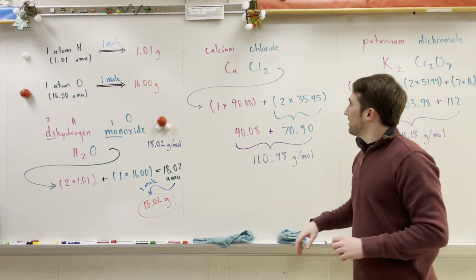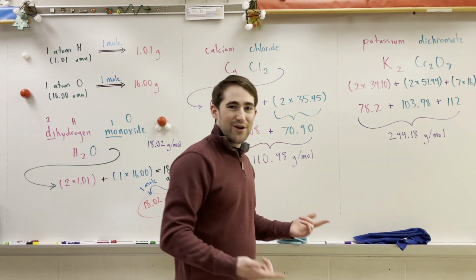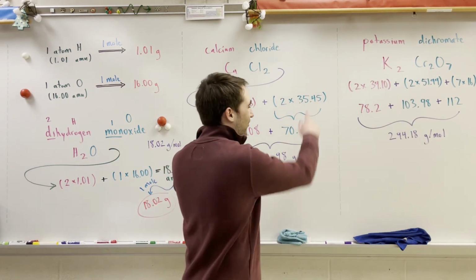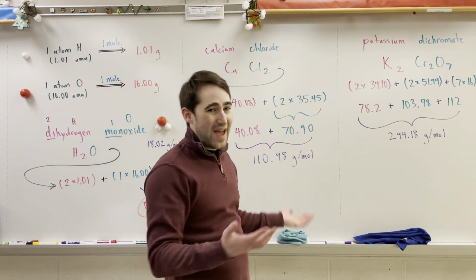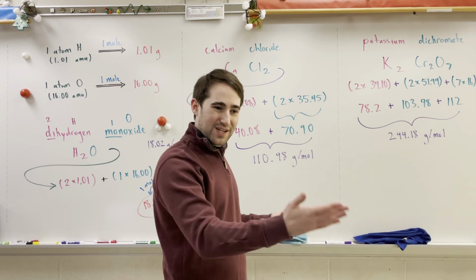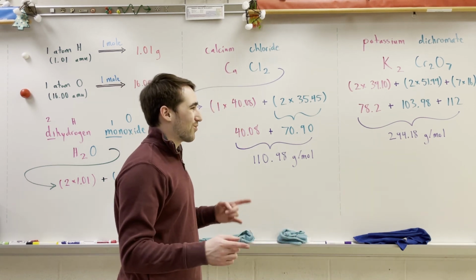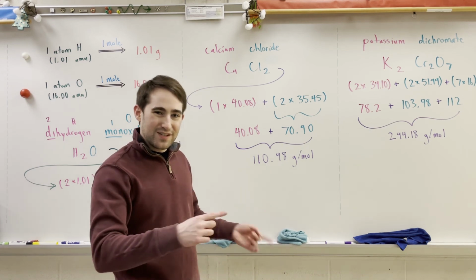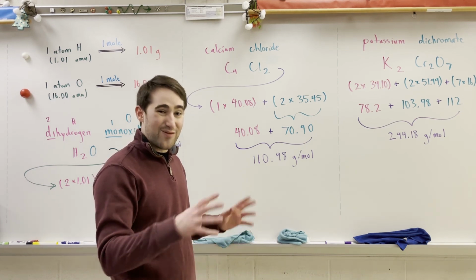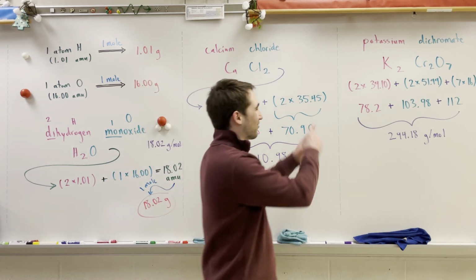Okay, so with the ones you have left, we can go and match up those compounds by figuring out their formula and then adding up the molar mass, comparing to 1 mole of each of those compounds. Okay. Now, if you notice that your molar masses don't seem to match up to the masses of the compounds that they are supposed to match to, you might need to go back and double check your formula.